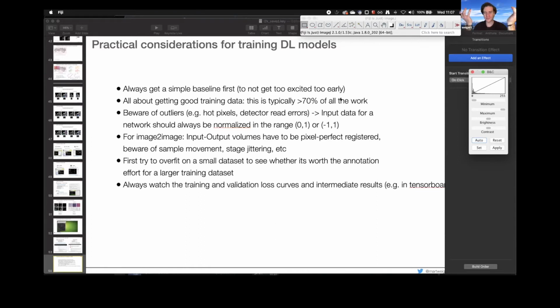So it could work even in these cases, but it's not guaranteed that it doesn't make a single object in the middle instead of the two that you actually want. This is hard to say in general. Typically it works for those cases that are easy to start with anyhow. The hard ones are those that a normal classical pipeline would just miss, and these are the cases you're actually interested in. These are the borders that cannot be inferred with classical approaches, and these borders are then not borders anymore in your annotations, right?